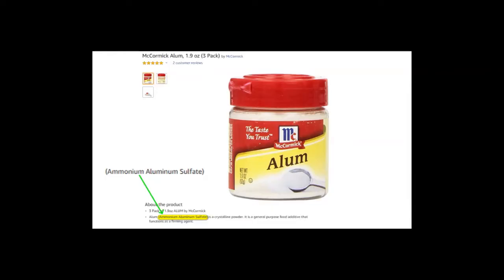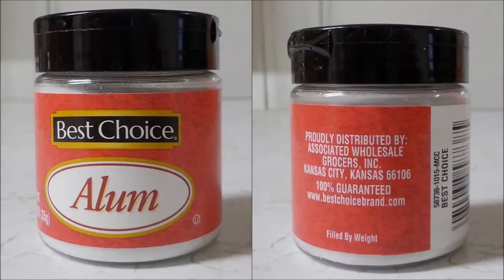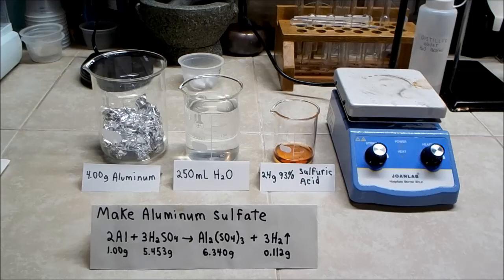Here's one that I was unable to determine exactly what it is. A good option is simply to make your own aluminum sulfate.